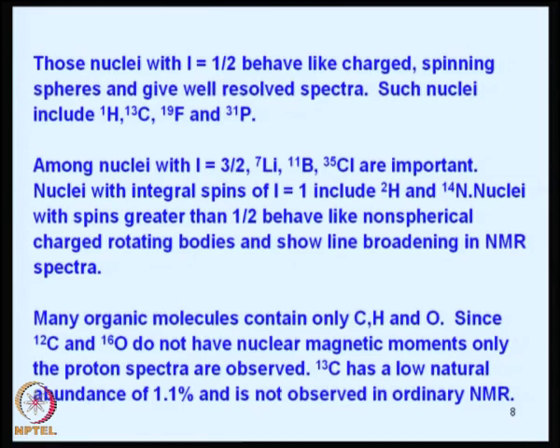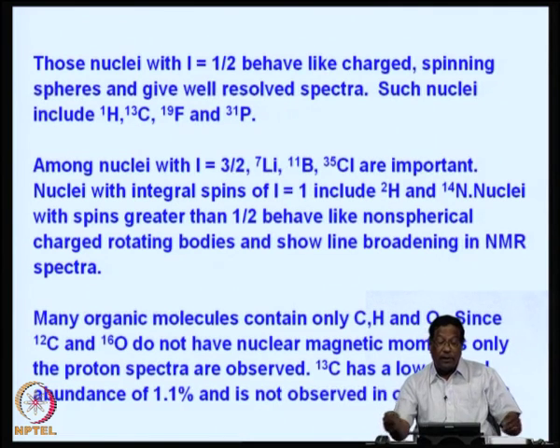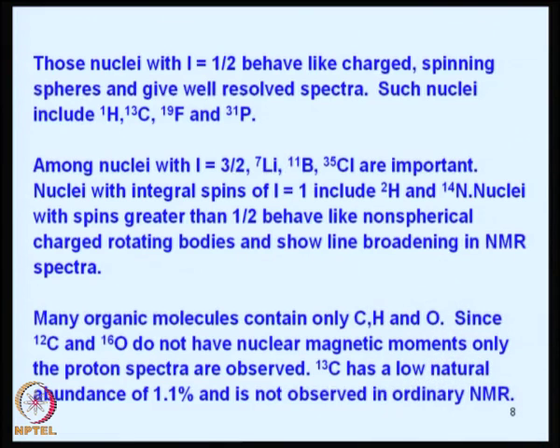So, nuclei with I equal to 1/2 behave like charged spinning spheres and give well resolved spectra. Such nuclei include 1H, 13C, 19F and 31P.